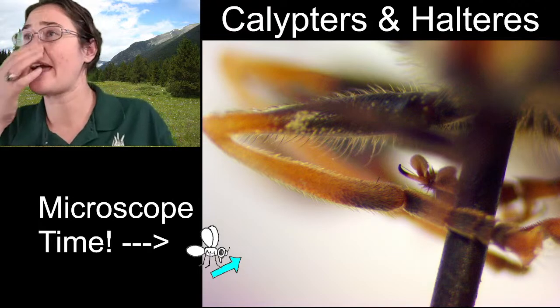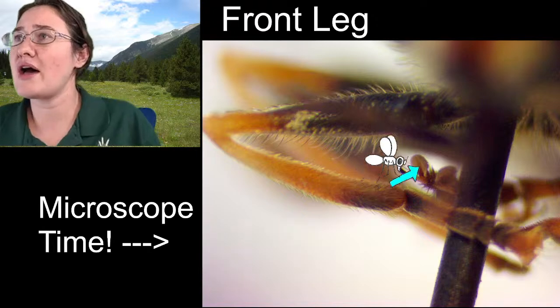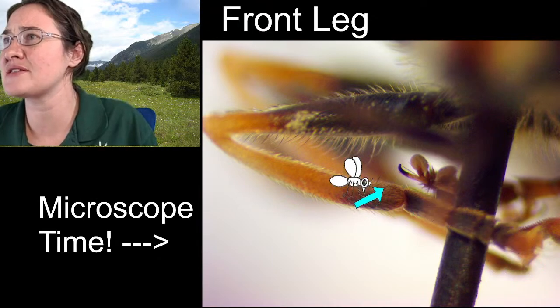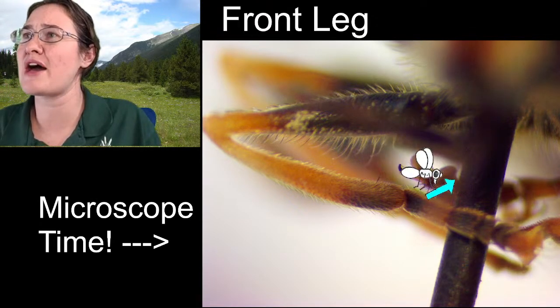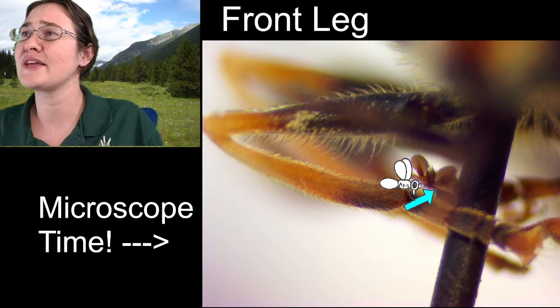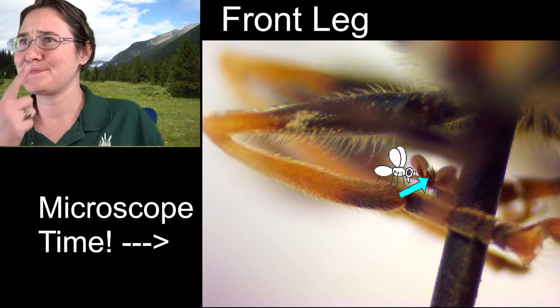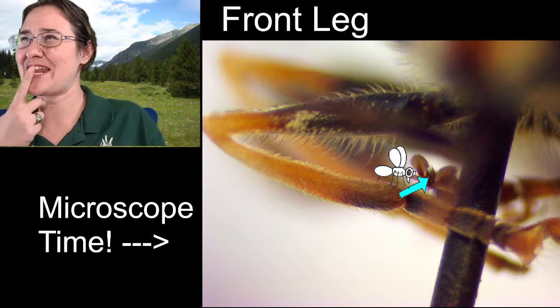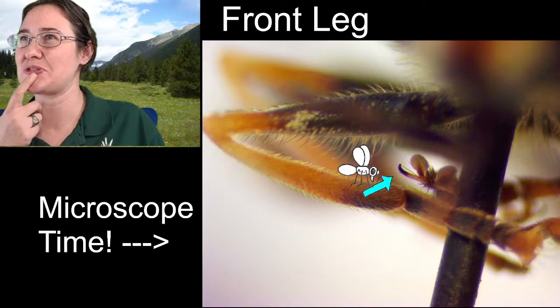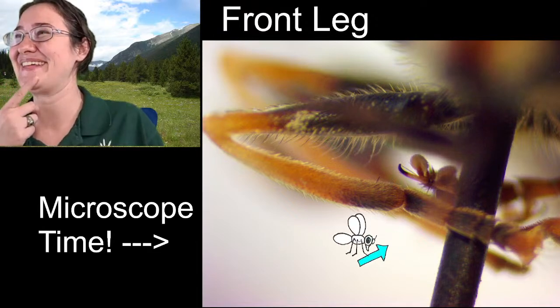So this is a front leg. This is the femur. This is the tibia. And these are the tarsal segments. You can see down here, this is the bottom of the tarsal segments on the other side. You have the tarsal claws here. And then you have the toe pads that I believe are called the pulvilli, but that might be the hair in between the toes. These are little toe pads. Yeah, they have cute little tarsi.